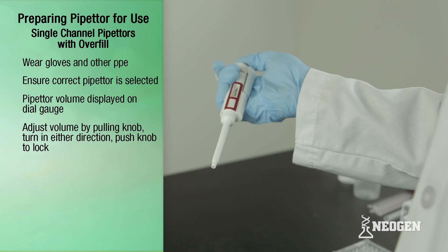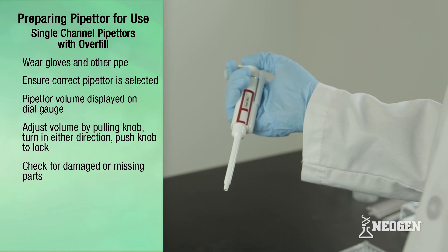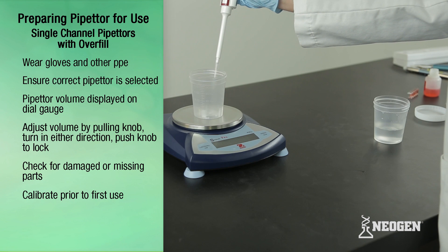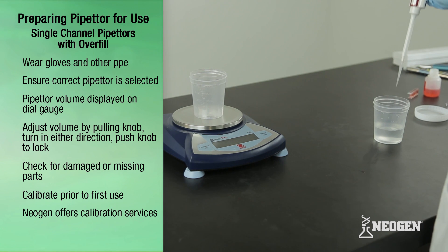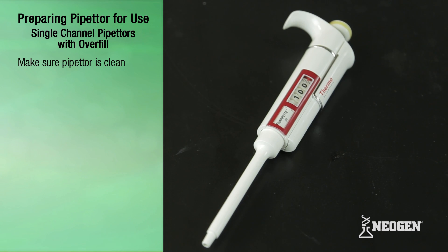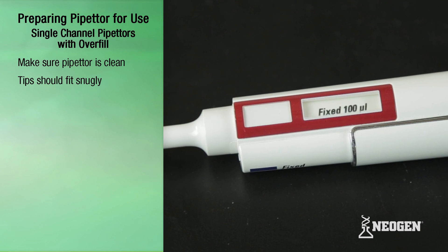Once the correct pipetter or volume setting is selected, the pipetter should be evaluated. If the pipetter has any missing, hanging, or damaged parts, it should not be used. If a calibration program is in place and the pipetter is out of calibration, it should be calibrated before use. Neogen recommends calibrating your pipettors once every year. Pipettors should also be clean on the outside, and the nozzle where the tip is attached should fit snugly into the barrel of the pipetter.